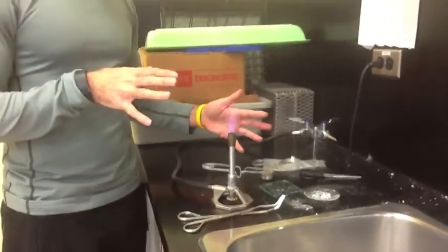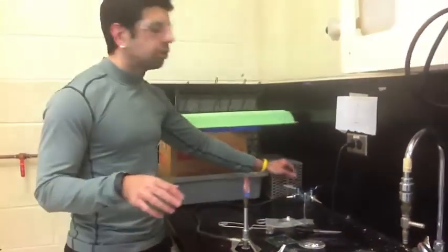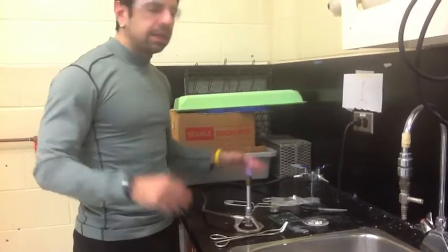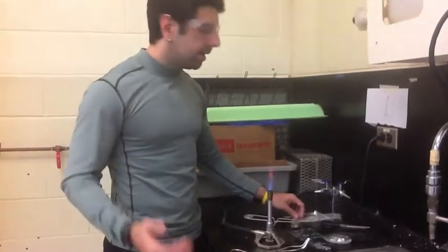If you don't light the Bunsen burner, after about 15 or 20 seconds of not being able to light it, please turn it off. You don't want the gas stinking up the room. I've had students get nauseous from the smell of the gas.